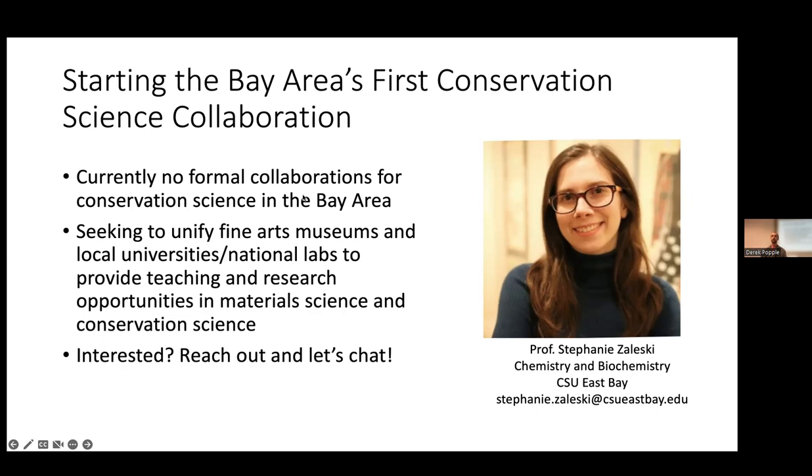Yeah, exactly. You kind of need two different samples, because the samples are so small. It's hard to see changes over, say, a millimeter scale, so you'd have to take two different samples and compare them. It's a cool technique, I think.